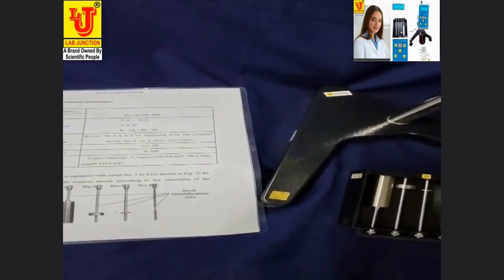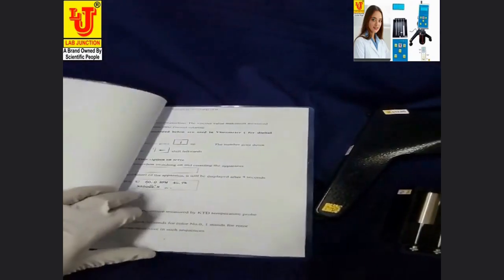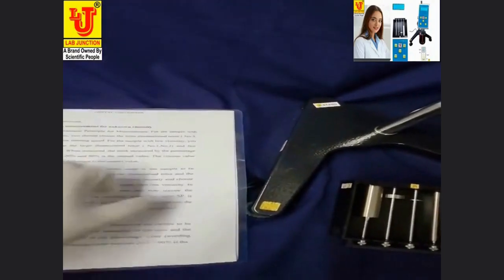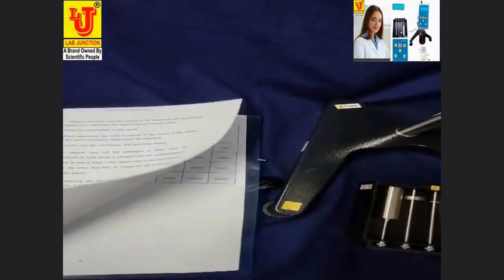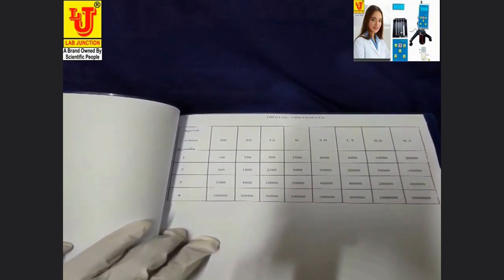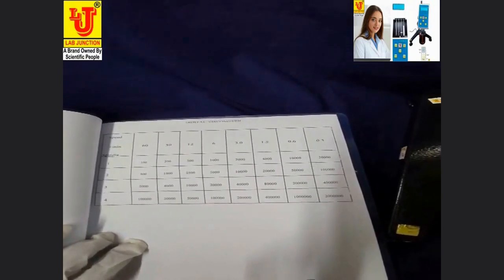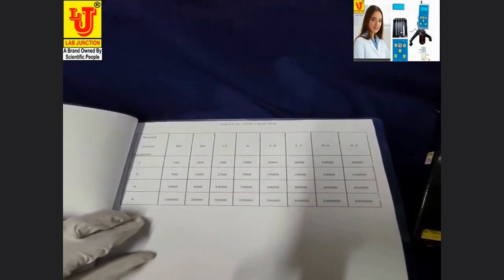All instructions and features are described in this instruction manual. This is the table of four spindles. The first row is for speed in RPM: 60, 30, 12, 6, 3, 1.5, 0.6, 0.3. These are the ranges for the four spindles in MPA.